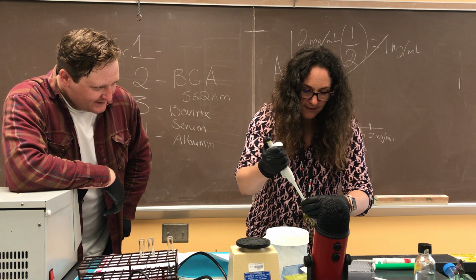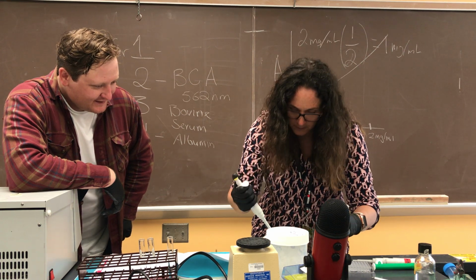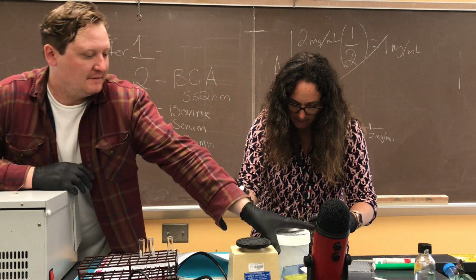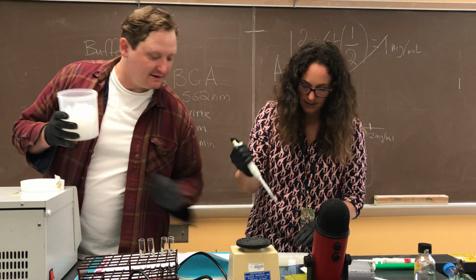Got a bubble in there. I think I need one more tube. Oh, you need an extra flip top. Get you one of those. Here you are. All right.